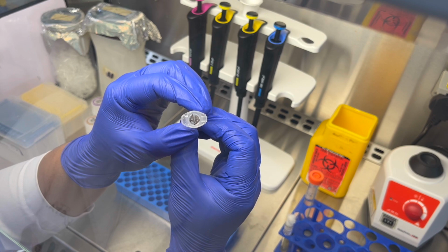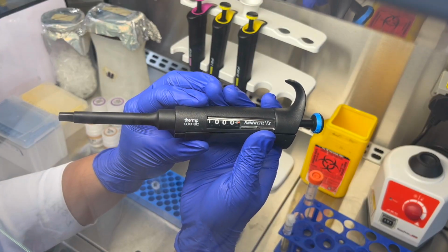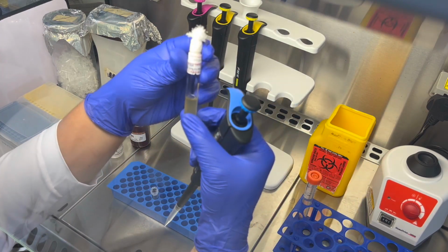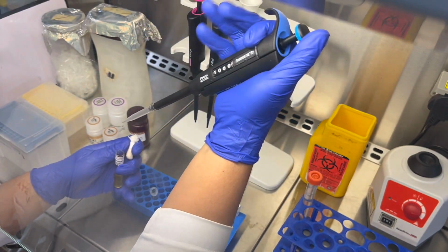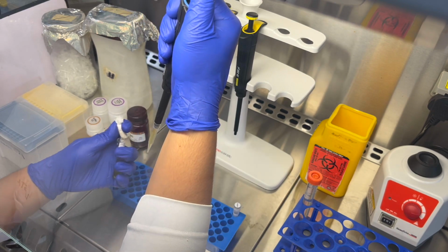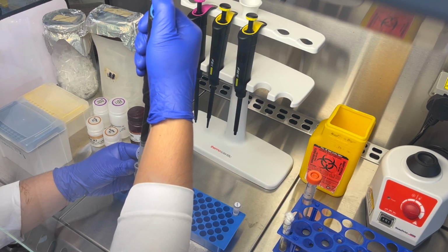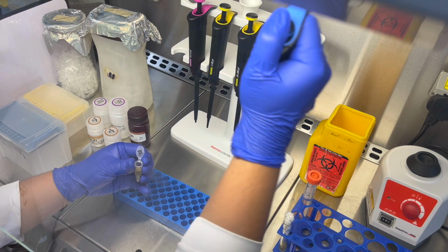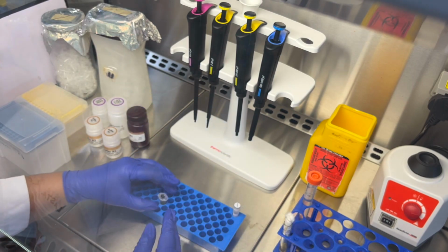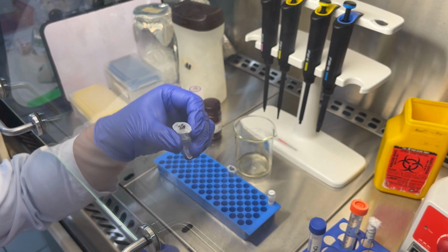First, we need to prepare your sample in a sterile microcentrifuge tube and label both the body and the cap. In this activity, we will be extracting DNA from a bacterial broth culture. So we take 1 ml of broth and dispense it into the labeled tube. We then centrifuge the tube to create a bacterial pellet. Now, after separating the bacterial pellet and the supernatant, decant the supernatant into the waste container.